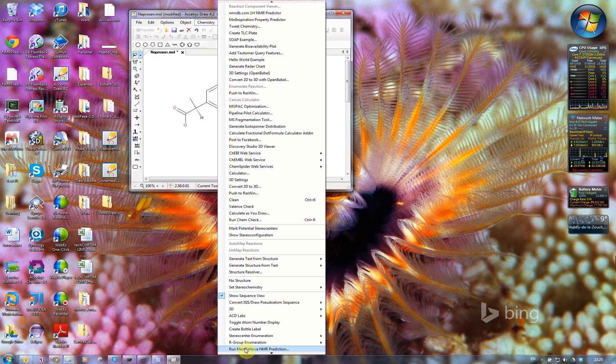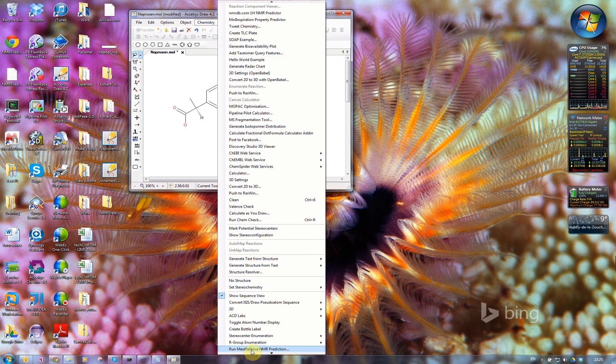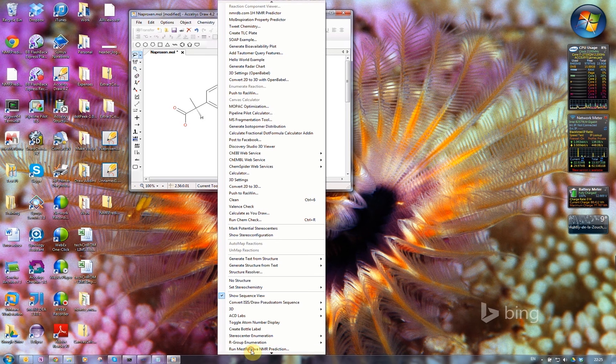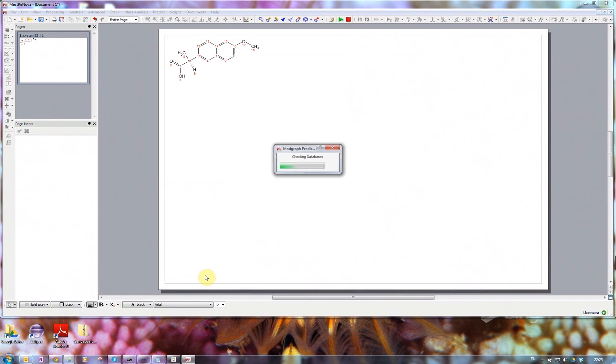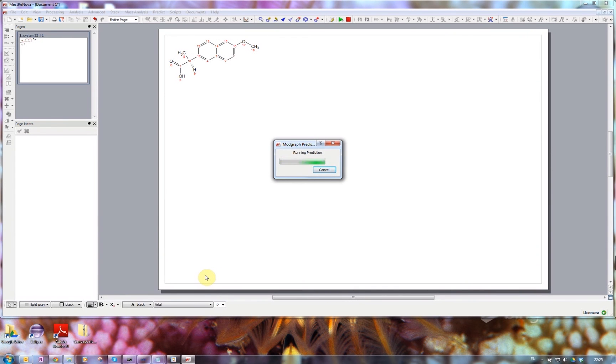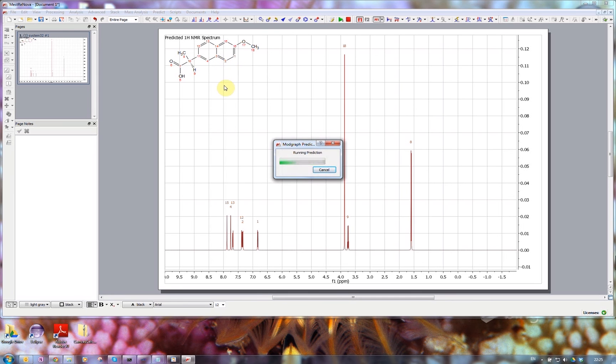So I now have this run Mestronova NMR prediction menu in my chemistry menu inside Accelerus Draw. I simply have to click on that. It launches the Mestronova software and sends across the mol file.